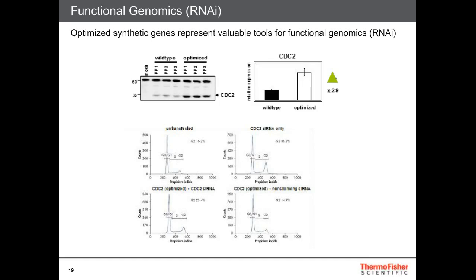But the true challenge of those experiments is always to differentiate between a true cellular phenotype and so-called off-target effects, since a given siRNA might also trigger a multitude of secondary mechanisms in the cell which could lead to a certain cell phenotype. So when you do those experiments, you always have to carry out a rescue experiment where you basically restore the wild-type phenotype.